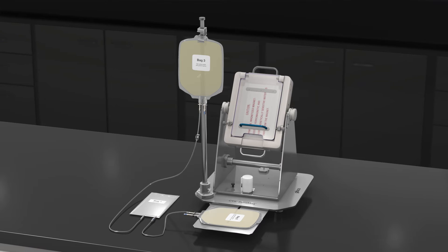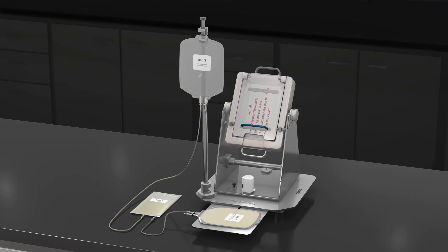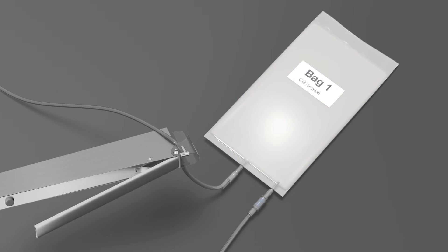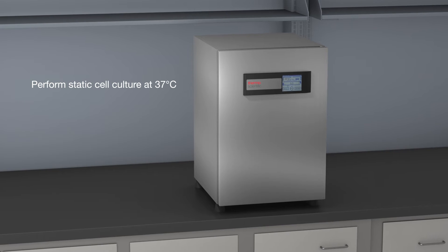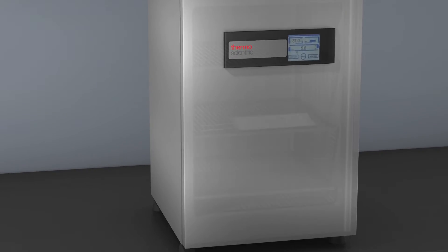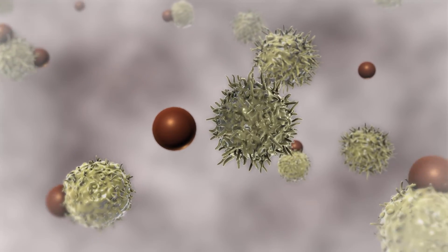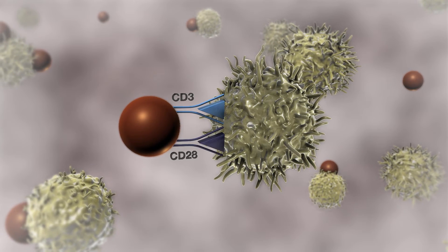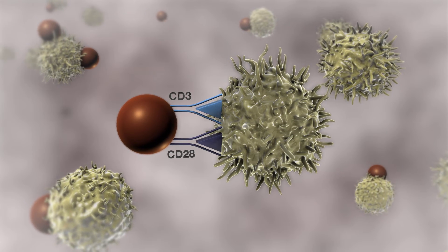Add media from bag 3 to the DynaBeads CD3, CD28 bound cells in bag 1, then seal off bag 1. Perform static cell culture in an incubator at 37 degrees Celsius to activate and expand the T cells. The combination of CD3 and CD28 antibodies on CTS DynaBeads magnetic beads provides both the primary and co-stimulatory signals required for optimal activation and expansion of T cells.